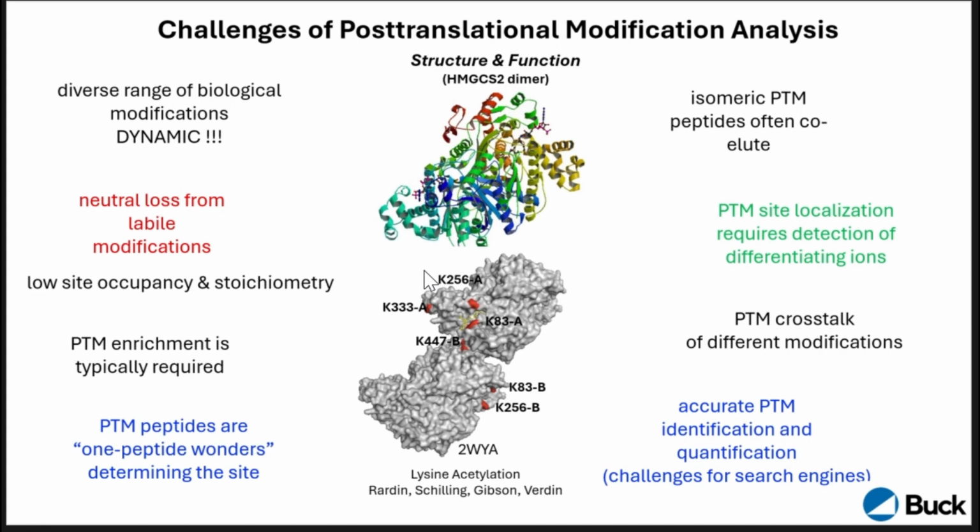And indeed, it's really important to be really sure about the quantification of each PTM peptide, because other than in protein quantification, you may only have one peptide that really now gives you the PTM status of that particular cell. So PTM workflows are actually quite different from other lysate or whole protein workflows. So they come with challenges and opportunities, I always say.